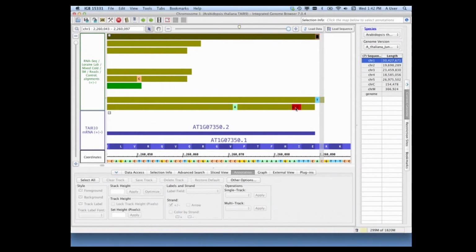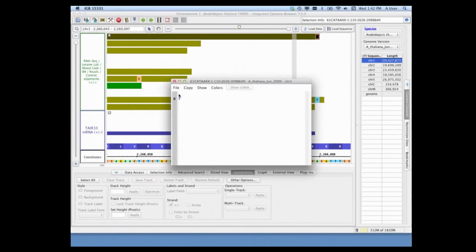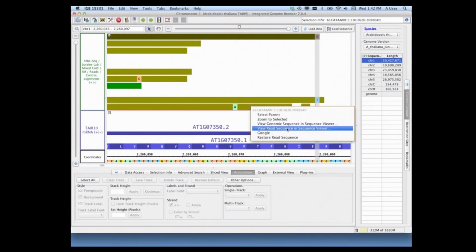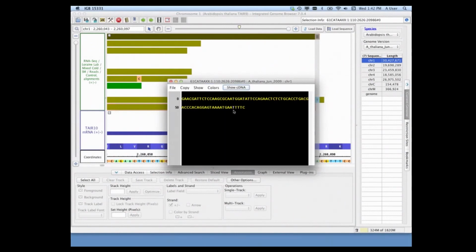And we can select the insertion itself, and it tells us that the letter that was inserted is T. We can select the whole read again, and it will highlight the insertion like this with this black, or if we go back to the original color sequence, it'll show it as a white T to indicate that there is the insertion.